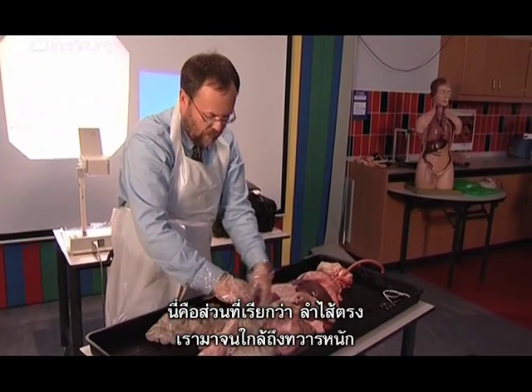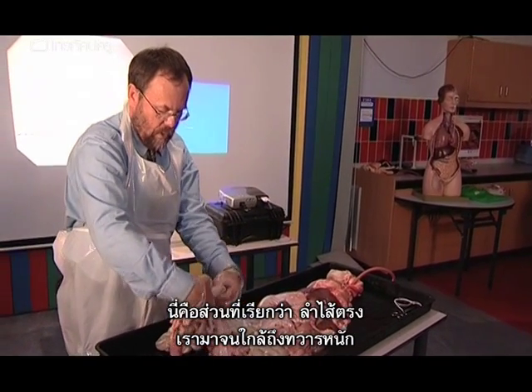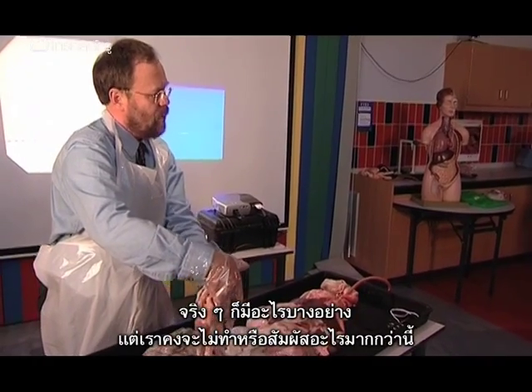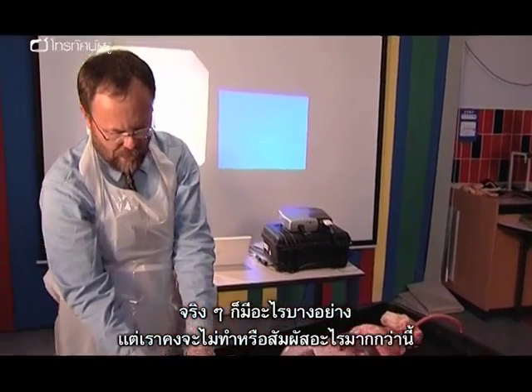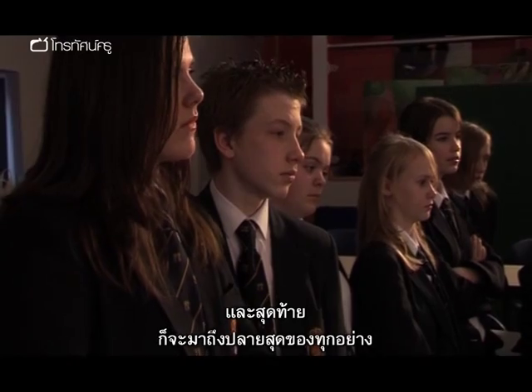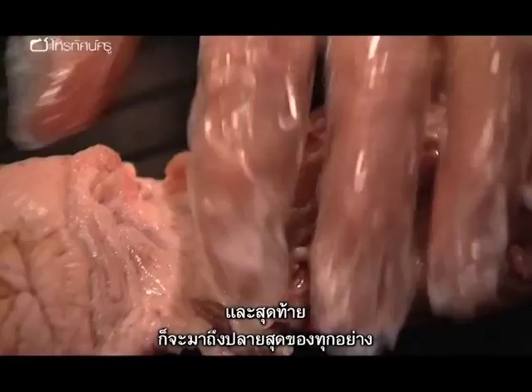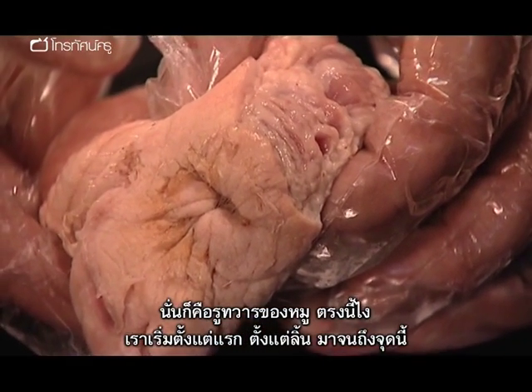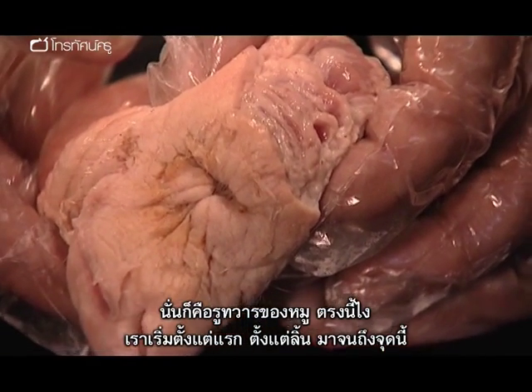"This is in fact the rectum. We come right down — the rectum's got some contents, but we won't be touching any of that. And then eventually you come right the way down to the very end of it all — that's actually the pig's anus just there. So we've gone all the way from the tongue, right the way through the system."